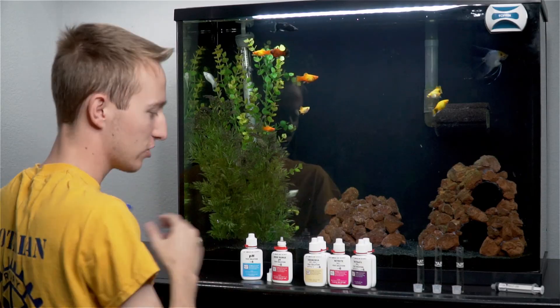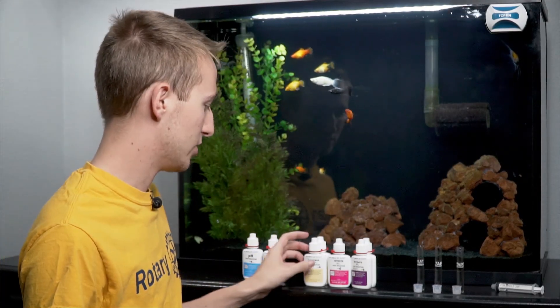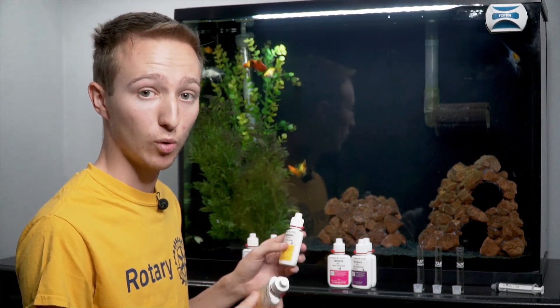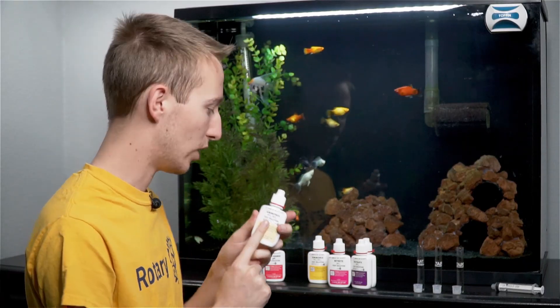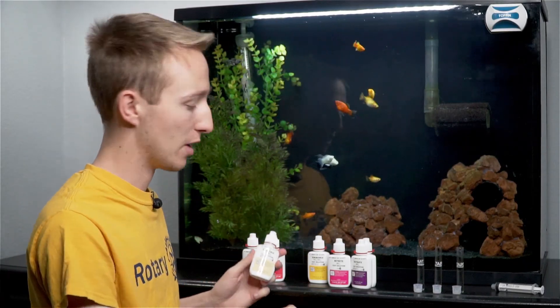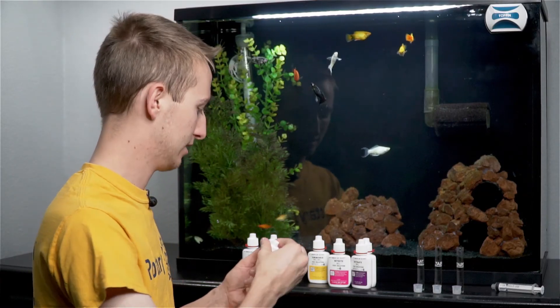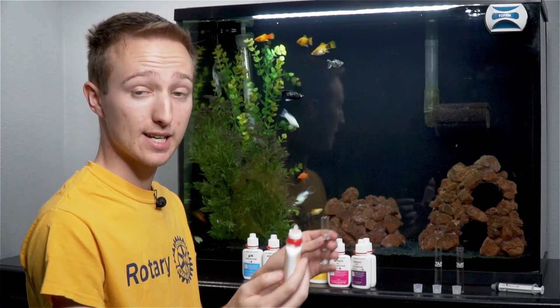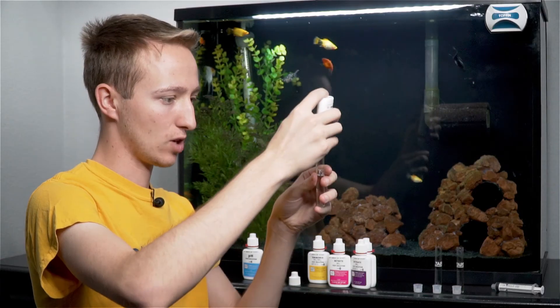Make sure you keep these in order — you can usually tell, but some colors are kind of similar. Now it gets a little more tricky with ammonia. There are two bottles for ammonia and you've got to be careful which one you add first — you want to add bottle number one first. It's also a lighter color yellow than bottle number two. I'm going to shake it just a tad, open it up, grab my test tube, and this one says to add eight drops, holding the bottle straight up and down.